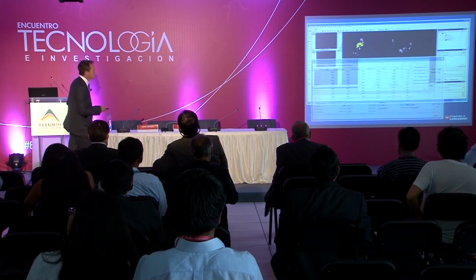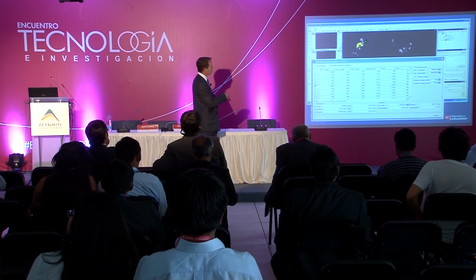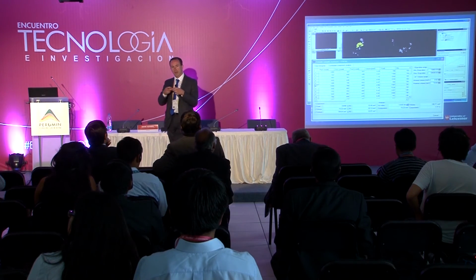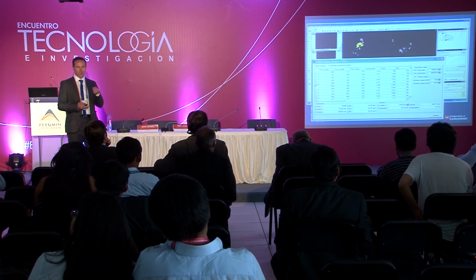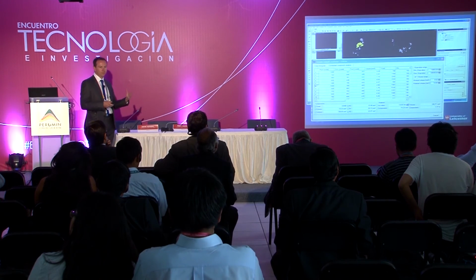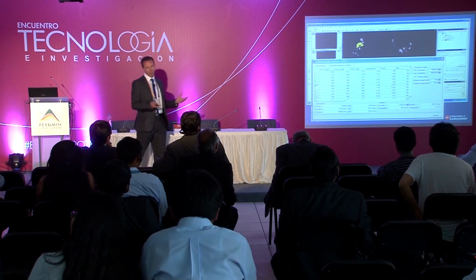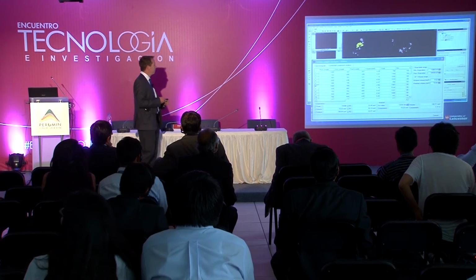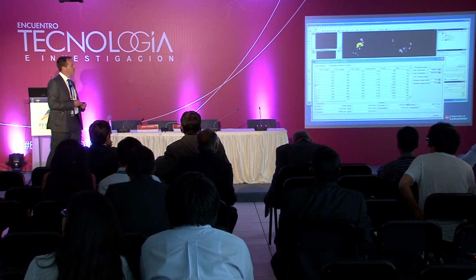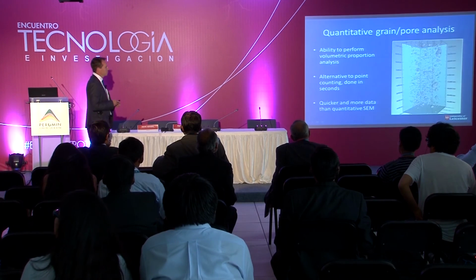I'll just zoom in on that table here. For every grain that we've isolated here, you can get a volume, X, Y, Z dimensions, and you can therefore work out a volume of gold in a volume of sample. You can work out its grade without sending it off to the lab. A rough grade. I wouldn't base a resource estimate on it, but it'll give you an idea of that. And what it also does is allow you to look at those nuggety ores.